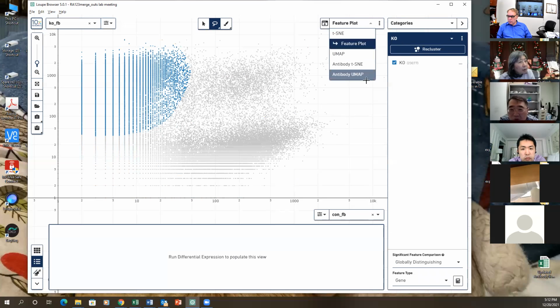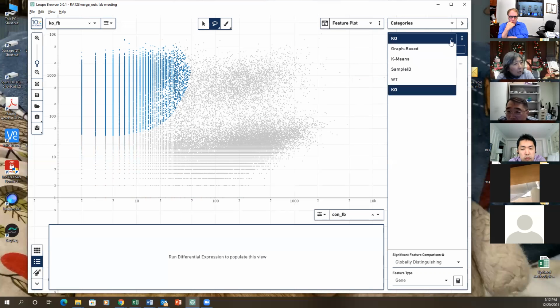Oh, Huishen, you did right. You should assign the knockout and the wild type in the same group. You name the wild type. You see, you have wild type and knockout.